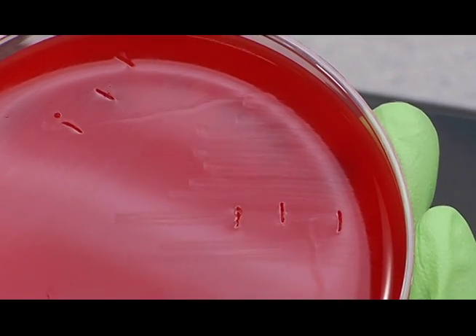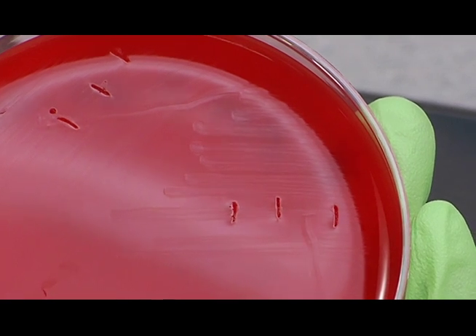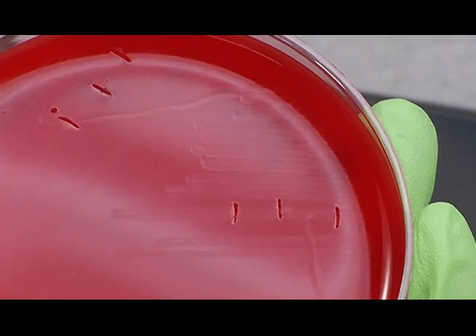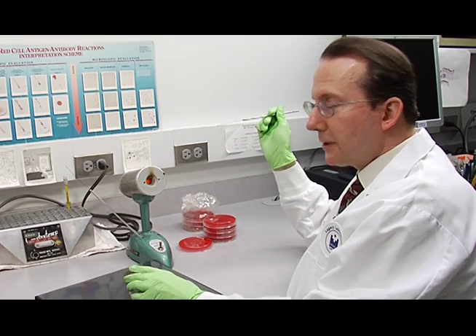The purpose of this is to get some of the organism down under the agar, which will enhance the beta-hemolysis. So now we're finished with streaking subcultures.